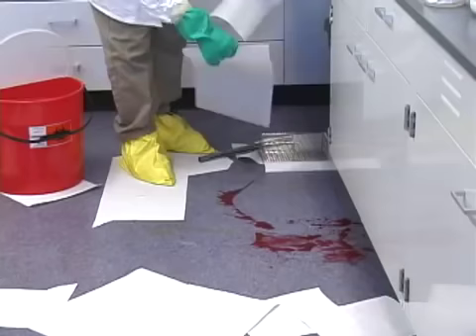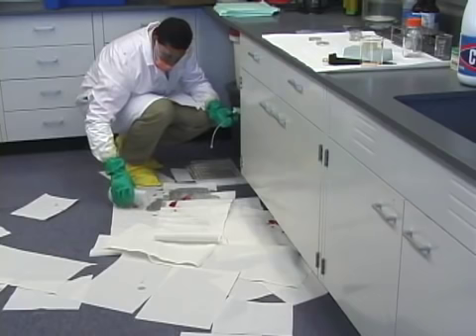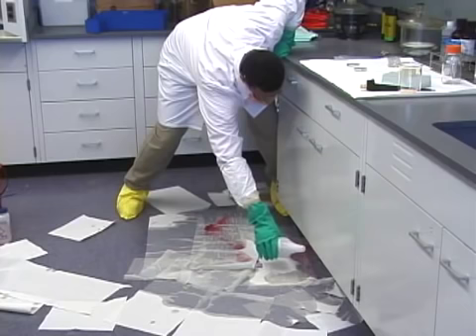Next, place absorbent materials on top of the spill and add disinfectant — usually a 10 to 1 dilution of freshly prepared bleach solution — first around the edges and then in the middle of the spill. The disinfectant must remain in contact with the spilled material for at least 15 minutes.